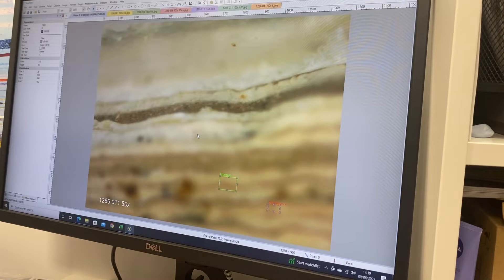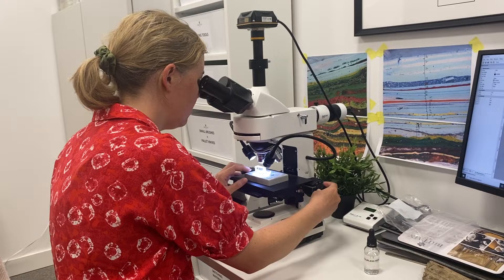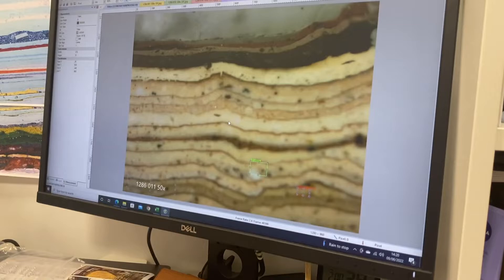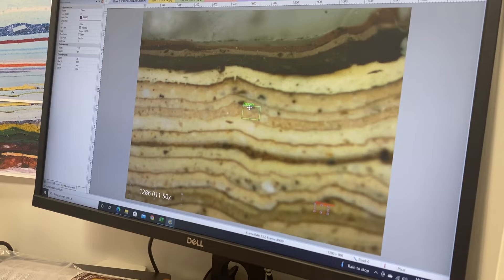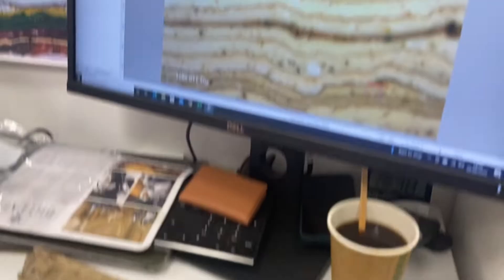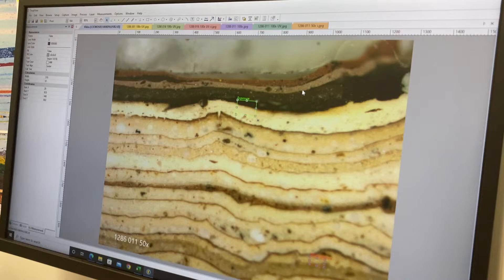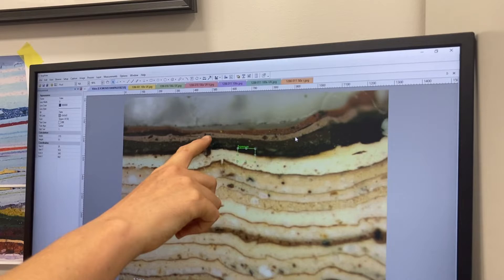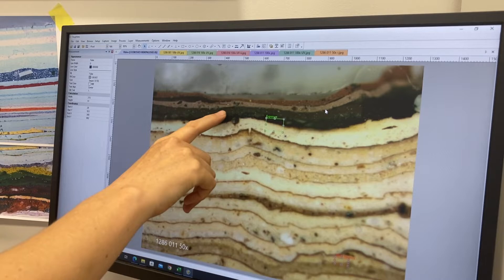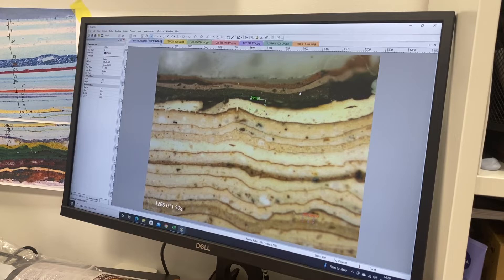Various inclusions in there, and then as we get more recent we'll go up to the top. So you can see the difference between the darker layers and how it's always been more of a stony color right up until recently. So those are three separate layers — I think this pale one is a priming layer for that top one there, and then again this is a dark layer with a sort of dark red. Generally you're looking at a primer or undercoat layer and then the top layer — the undercoat is quite often not exactly the same color as the top coat.